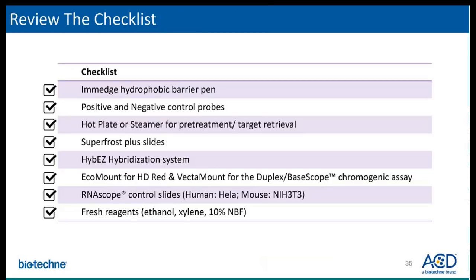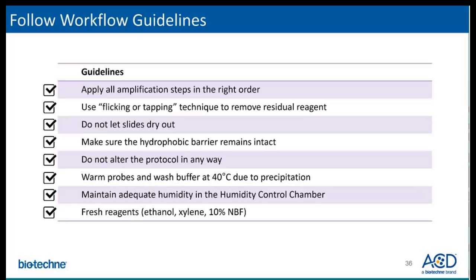On this checklist are some key components that can help ensure your success with RNAscope assay — for example, using SuperFrost Plus slides, using appropriate mounting media, using fresh reagents, and using the hot plate or steamer for pretreatment. We also have some recommended general guidelines: once you begin the assay, do not let the slides dry out; do not alter the protocol; and warm the probes and wash buffer before using at 40 degrees.